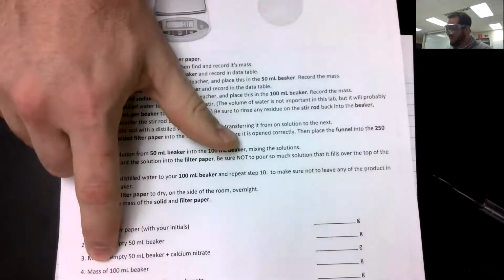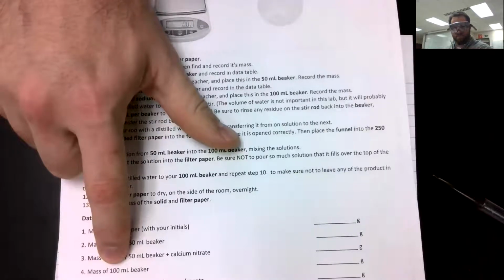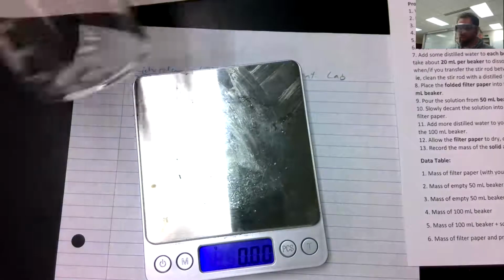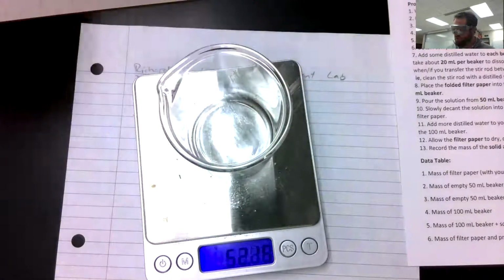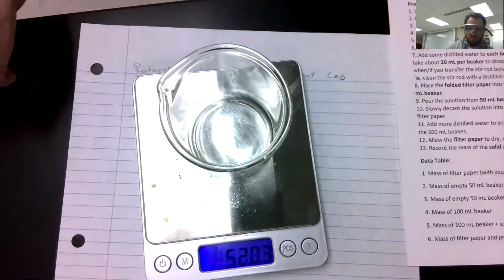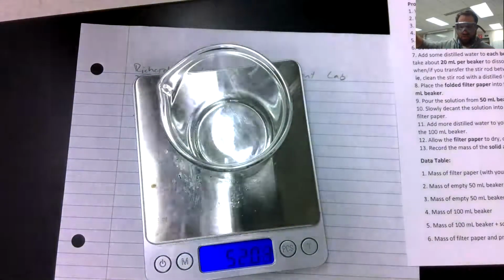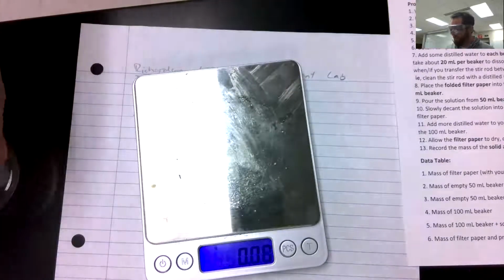Number 4, we need to find the mass of our 100 milliliter beaker. So the 100 milliliter beaker is the middle-sized one. So make sure it's zero, then place that on there. And I'm reading 52.03, 52.04 once it settles. Oops, otherwise jumping. I'm going to call that 52.04.